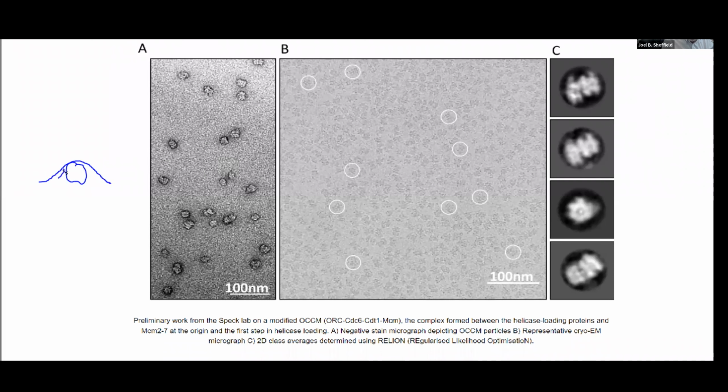So the negative stain is actually all of this stuff here. And to a certain extent, it goes into your sample. But you've got a three-dimensional problem with it, as well as this question of how much penetration and how the stain itself modifies what you're seeing.